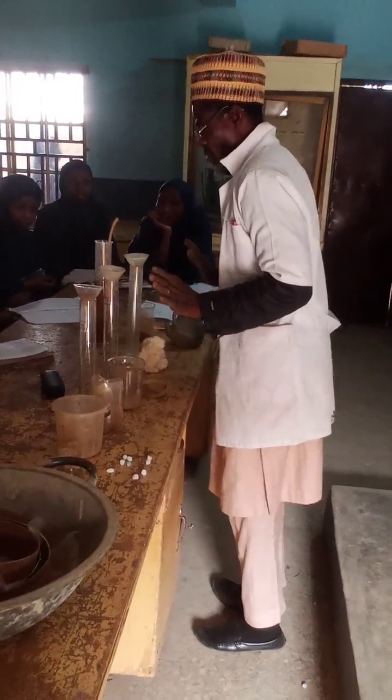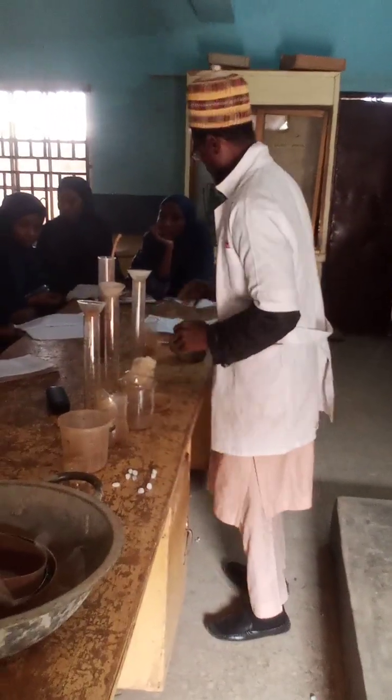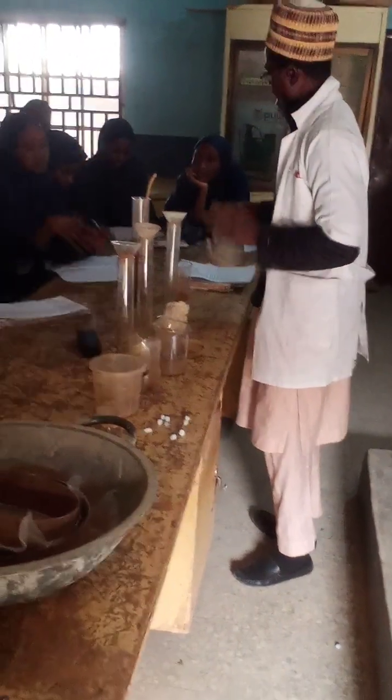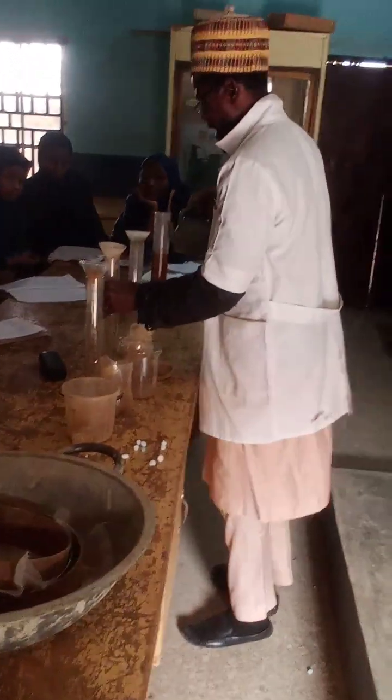So don't let us go to conclusion yet. You have set up the experiment. The next thing is to add water. That's the reason why we need a stopwatch, so that we determine the time we are adding the water.